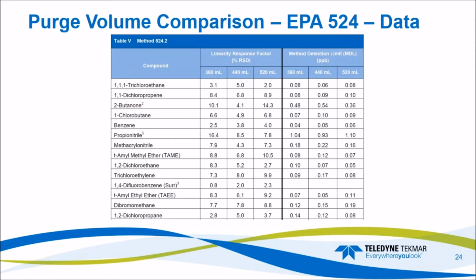All right, again, if you stick to a pretty standard 524.2 method, your RSDs look really great. Again, for some of those compounds, they need just a little bit more time to desorb. All of these look pretty great. The MDLs look good.